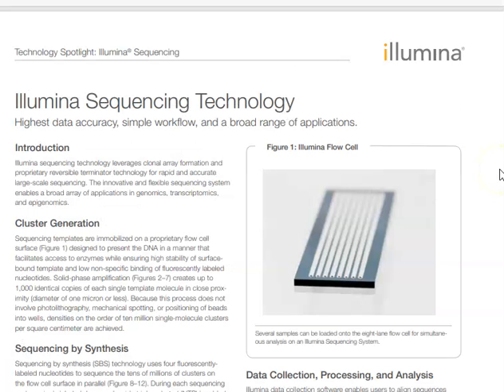So we'll start with the PDF document that Illumina have supplied explaining the sequence technology, and this all takes place on what we call an Illumina flow cell, and this technology requires fragmenting the DNA and somehow attaching them to this flow cell and then performing what we call clonal bridge amplification. So if you can imagine taking a piece of some human DNA, fragmenting it into small pieces, and we actually attach oligos to each end, and those oligos on each end of the fragmented DNA bind to oligos which are pre-populated on this flow cell.